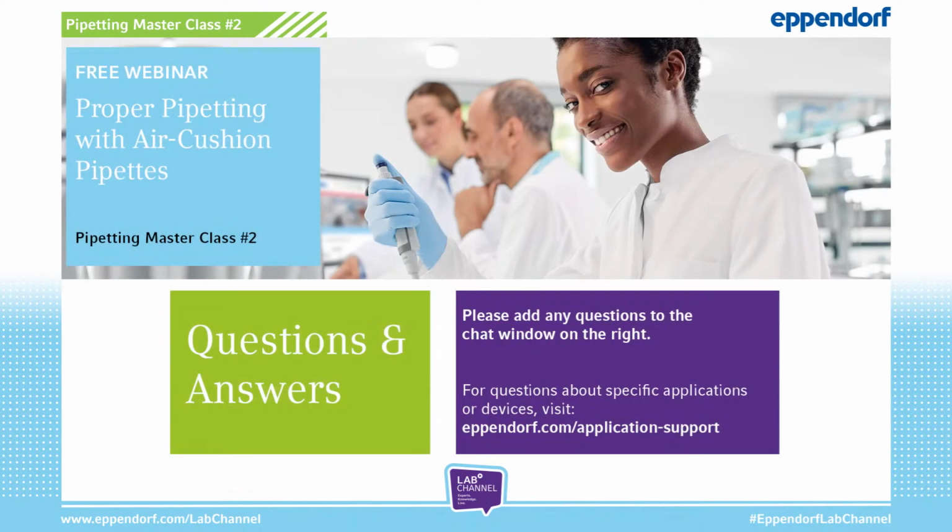We indeed got a few questions via the chat tool. Let me quickly go through. So basically, we have a question regarding the lifetime of mechanical pipettes. The question is, what is the lifetime of a mechanical pipette, and does the efficiency of air cushion pipettes reduce over time?